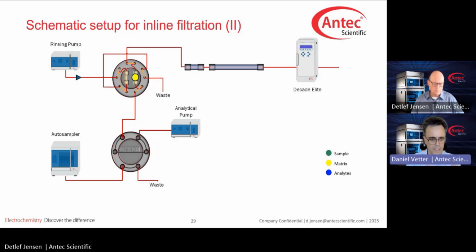Detlef, manual sample preparation filters are usually single use. And here we use the filter multiple times. And is there a risk of cross-contamination also?